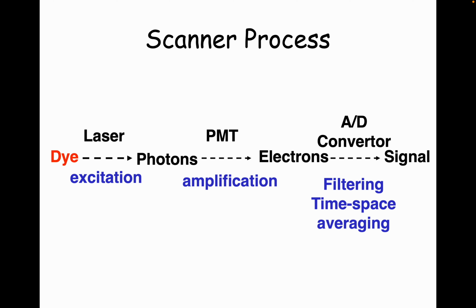So they're pretty neat. So the way a microarray experiment works, you're going to have some kind of dye, which is going to highlight whether or not something has happened. So in the case of the kinase array, you'll put the protein on there. It'll either add phosphates or not, and then you can come over the entire chip with one antibody that binds phosphoserine or threonine, and another antibody that binds phosphotyrosine.